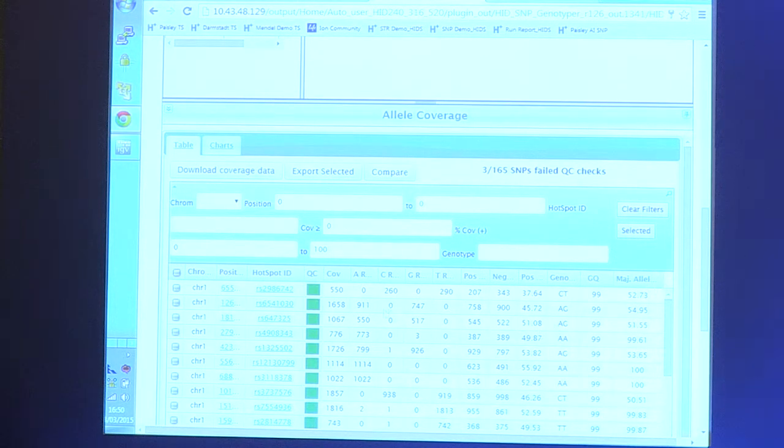And of course, similar to GeneMapper software, if you like, there are some settings behind this analysis that you can customize that will define some of those cutoffs, as in how much coverage do we need for the call to be made, what should the balance between the two different alleles in a heterozygote be before it can be called. You'll see some other metrics here, forward and reverse reads, in this case 207 in one direction and 343 in the other. You can set some bounds on what those should be for the genotype to be called in the settings of the plugin.